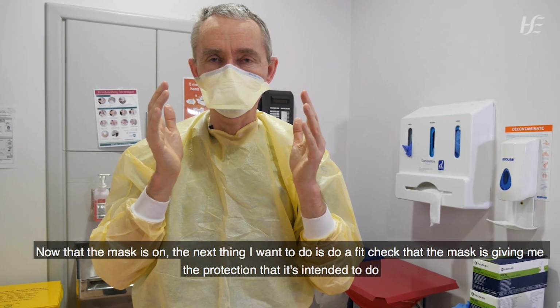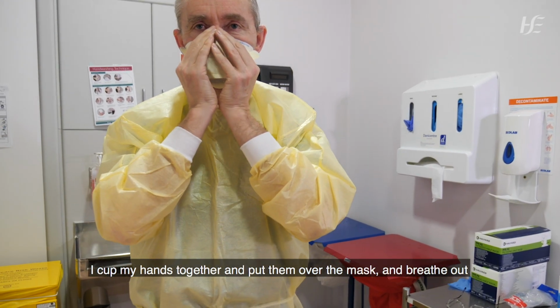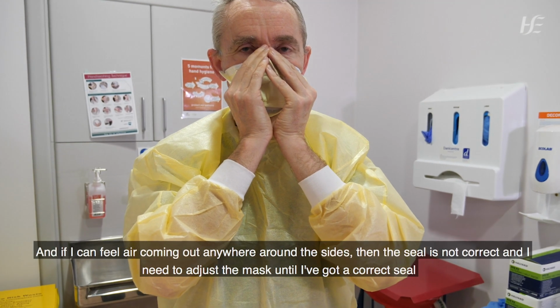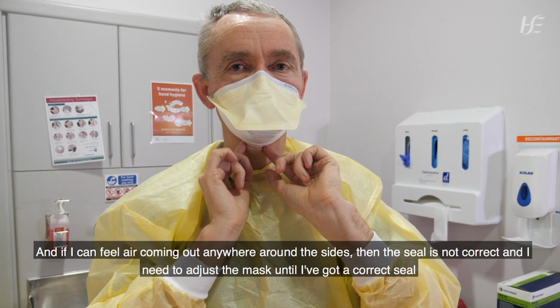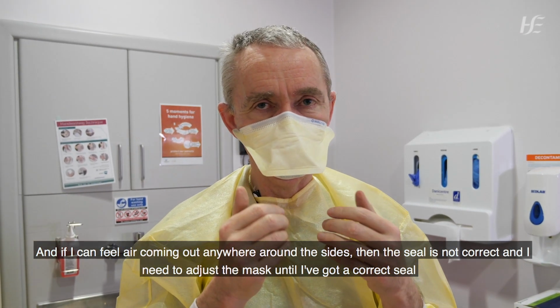So now that the mask is on, the next thing I want to do is do a fit check that the mask is giving me the protection that it's intended to do. So I cup my hands together and put them over the mask and breathe out. And if I can feel air coming out anywhere around the sides, then the seal is not correct, and I need to adjust the mask until I've got a correct seal.